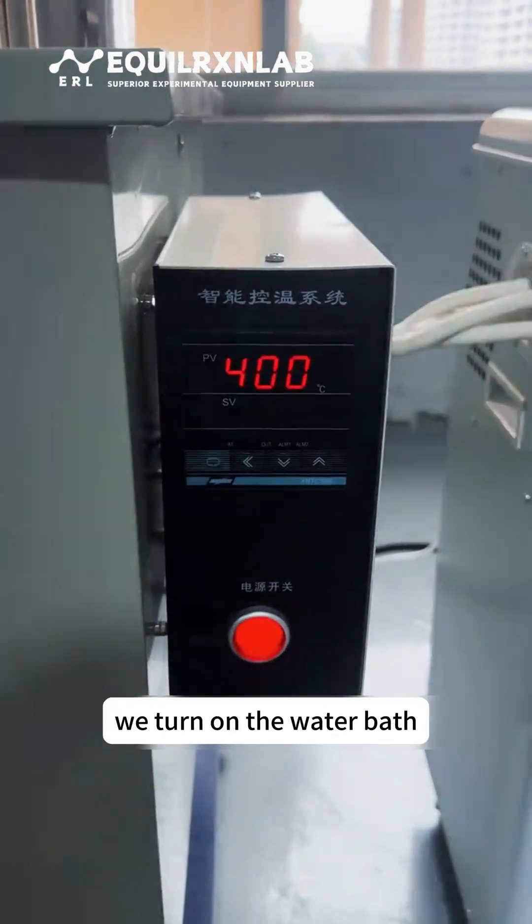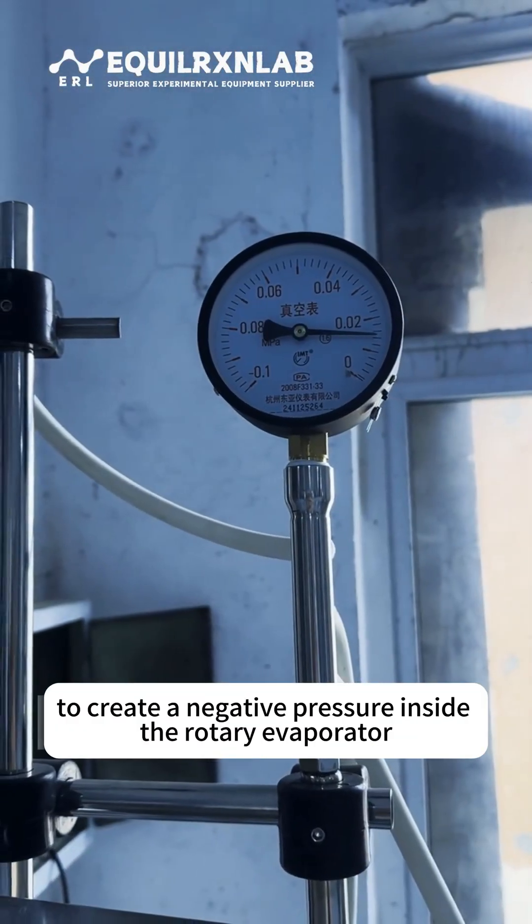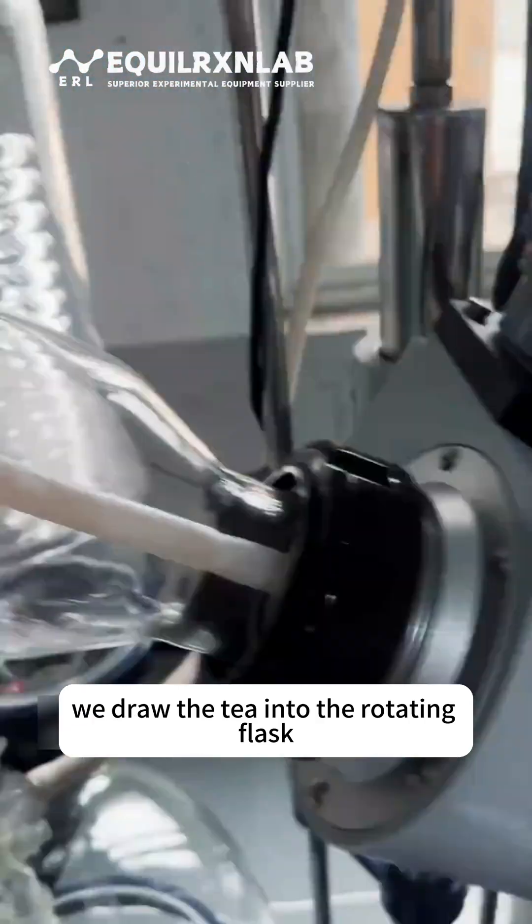Once everything is ready, we turn on the water bath and set the temperature to 70 degrees Celsius. Next, we turn on the vacuum pump to create a negative pressure inside the rotary evaporator. Using this vacuum principle, we draw the tea into the rotating flask.